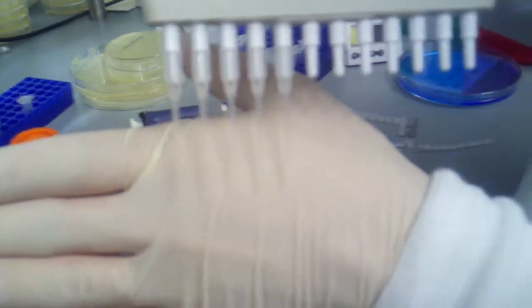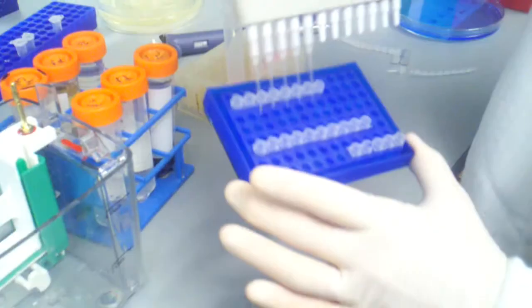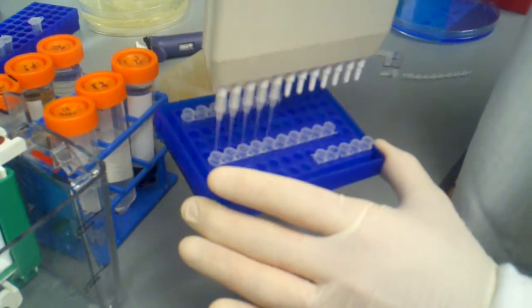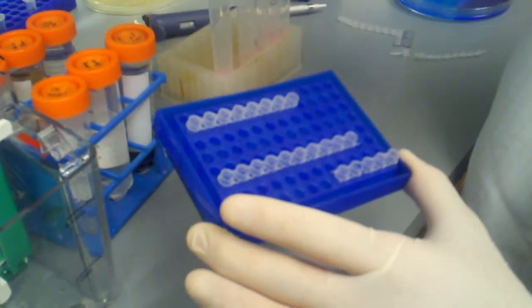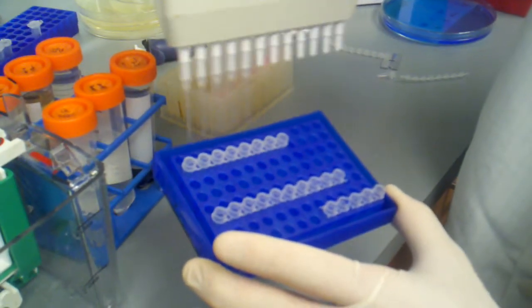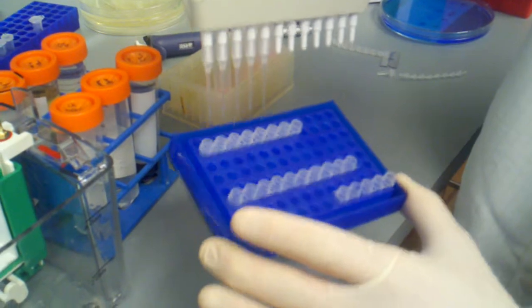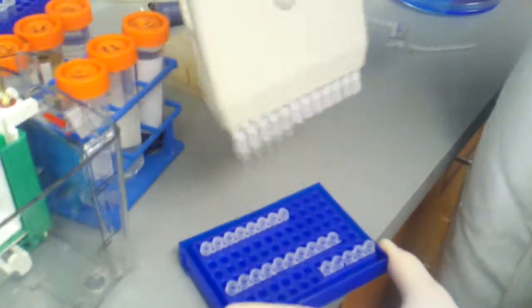I'm going to pull up 1 microliter, double check everything. I don't know if you can see that. Hopefully it comes out. And I'm going to pop it in to our loading buffer. Double check it. Okay, I've ejected. And then, since this is kind of waste, I can go back in there. I'm going to double dip. Normally you don't want to do that, but again, I've just aliquoted out.